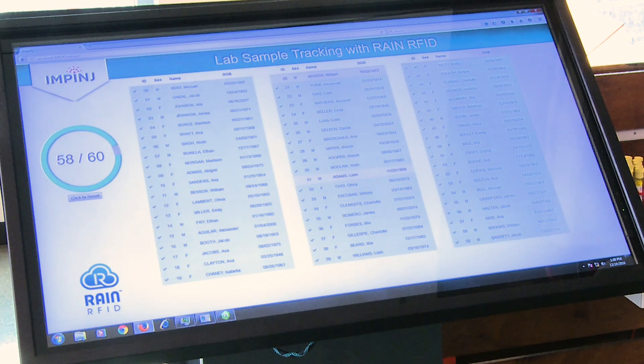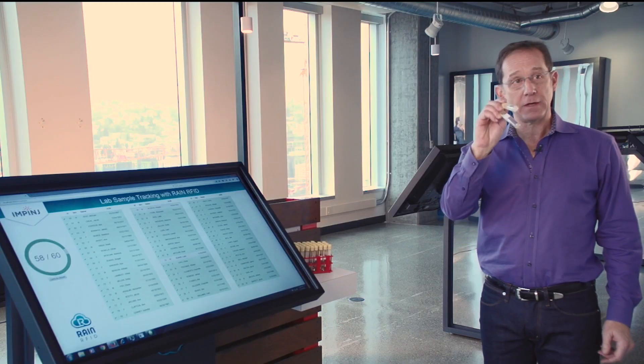You can see that very quickly it identifies 58 out of 60 of those samples, and it has shown that the two that I have in my hand are still missing.